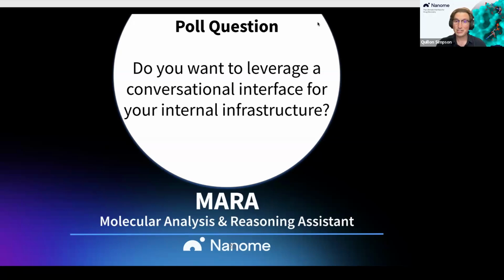Yeah, I think that's actually a great thing to raise, Edgardo. Definitely one that I should have had there. So in the public beta, we put limits onto how long the code can run and the type of functions that you can utilize. In the full deployment of Mara, those limitations are significantly less restrictive in how you can interact with it.